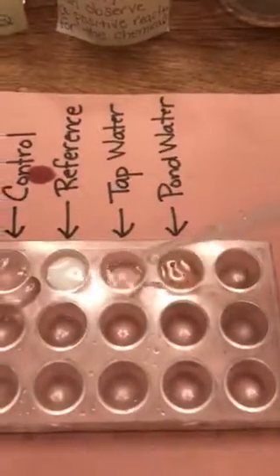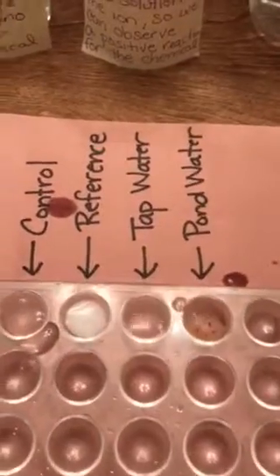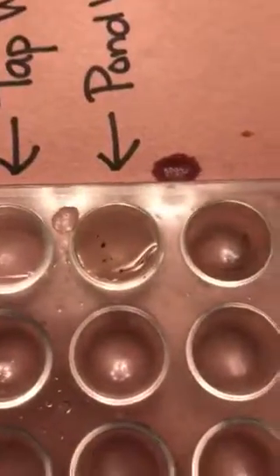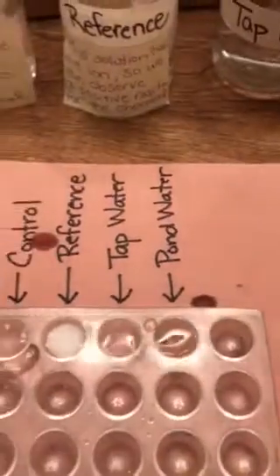Now let's see if I see that in my tap water. I hope not. Okay, tap water's still looking pretty good. Now let's look at my pond water. Well, thank goodness it doesn't look like there's any lead in my pond water.